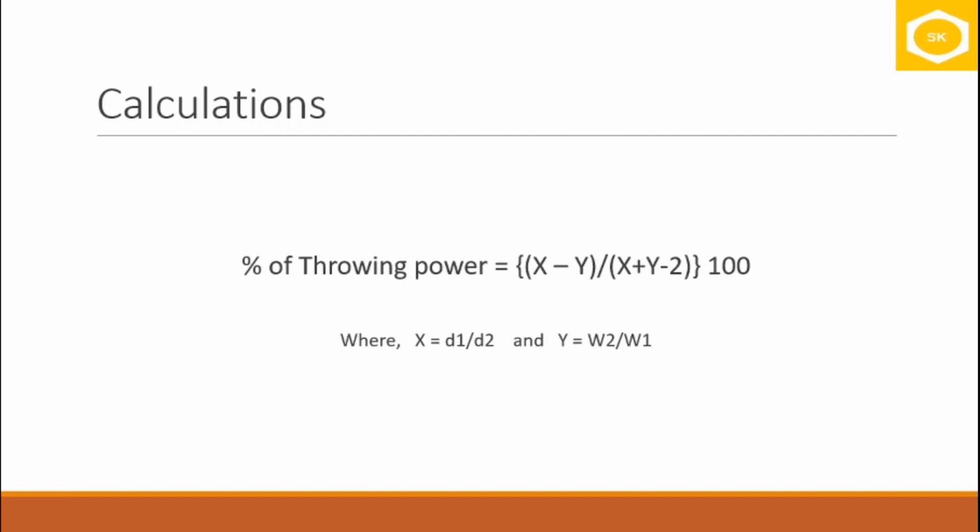Now using this value, you can estimate what kind of quality of deposition you can expect. If percentage of throwing power is high, or say 100%, the uniformity of deposition can be assured. If percentage of throwing power is little less, then uniformity can be a question. The amount of metal deposited on the substrate may vary a little bit in thickness. So that is how percentage of throwing power of an electrolyte helps us to identify the quality of plating bath solution in a plating process.